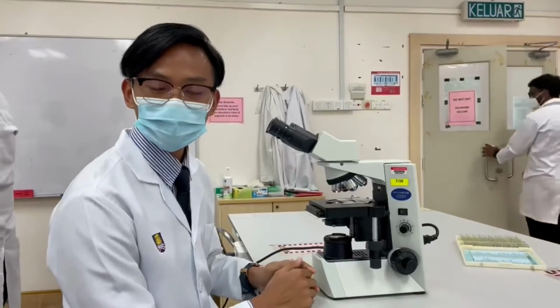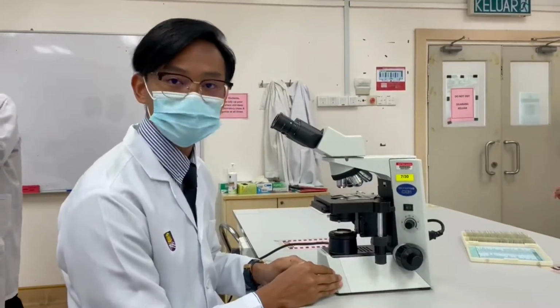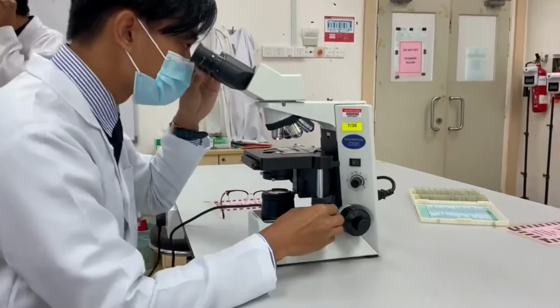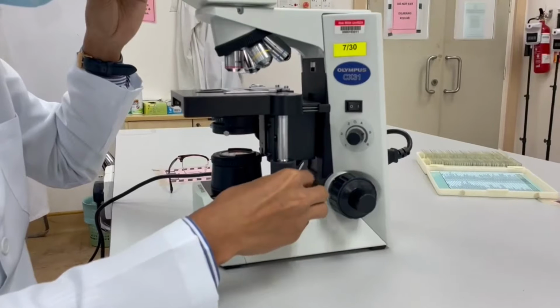If nothing can be seen, try to use the XY translational knobs to move the slide either vertically or horizontally, corresponding to the XY axis, until you see the specimen. And then we can try to reduce the light source by closing the iris of the diaphragm below the stage.